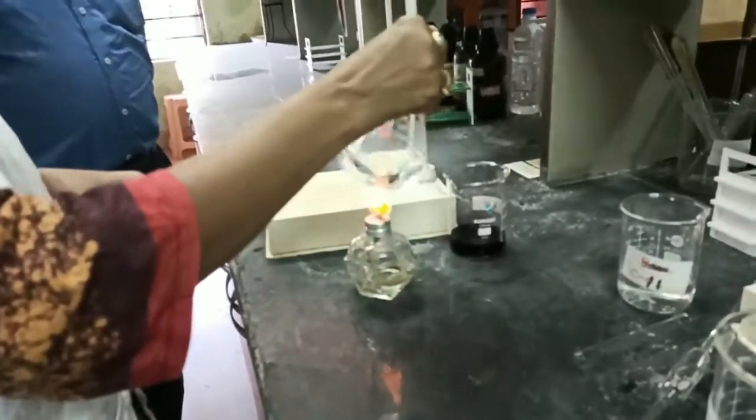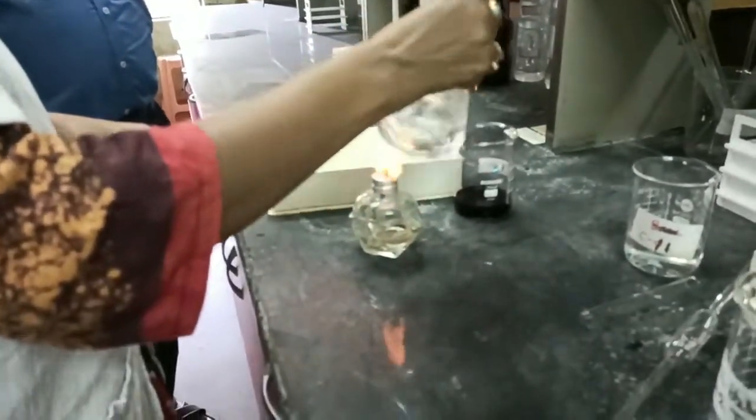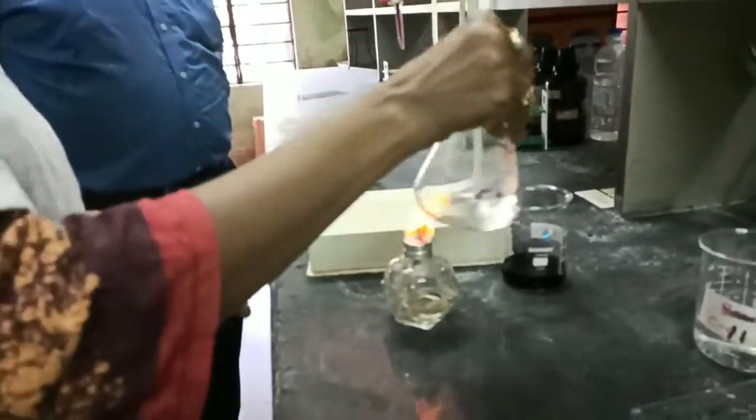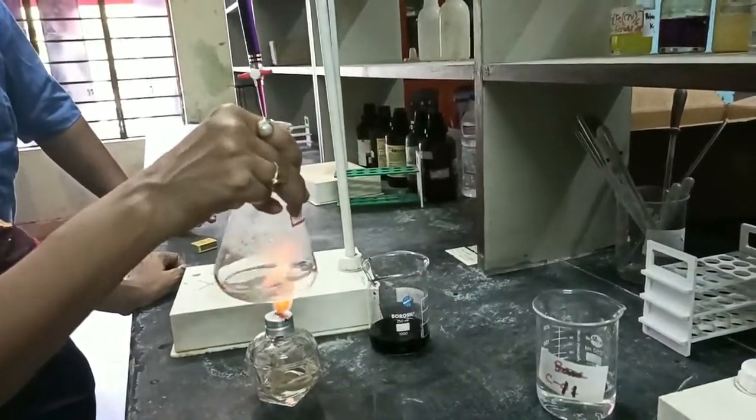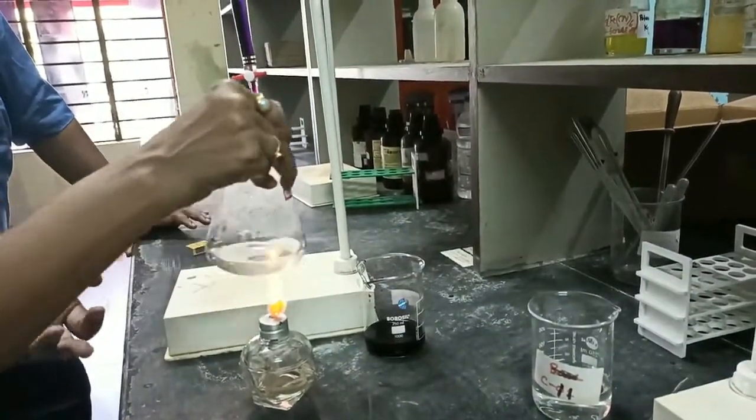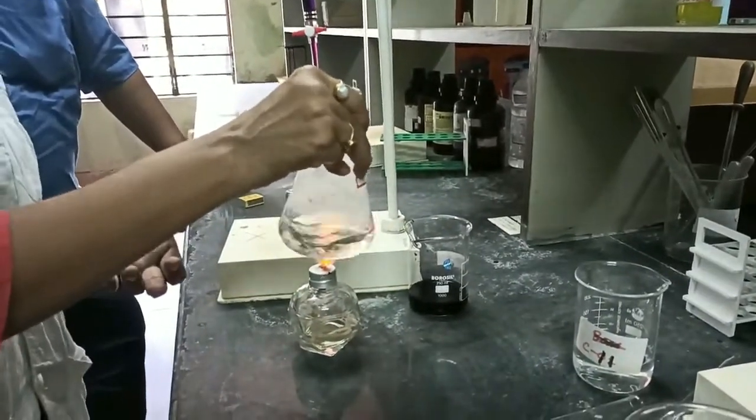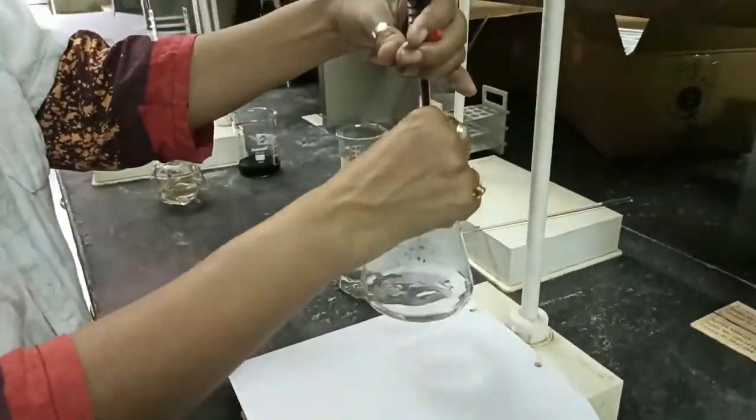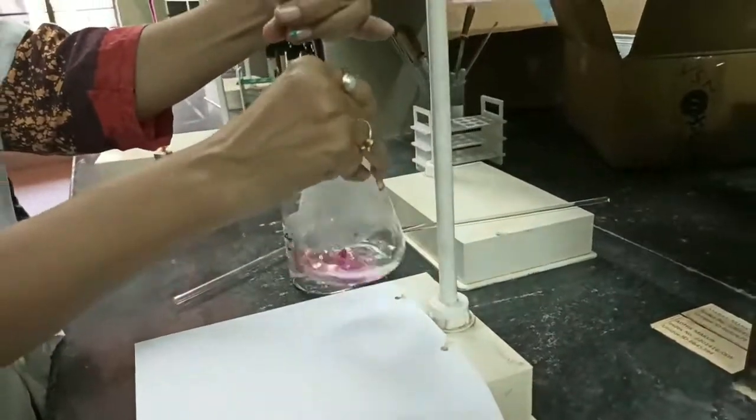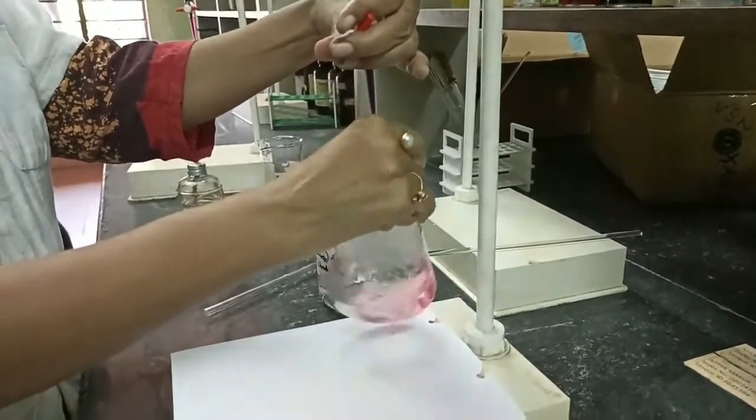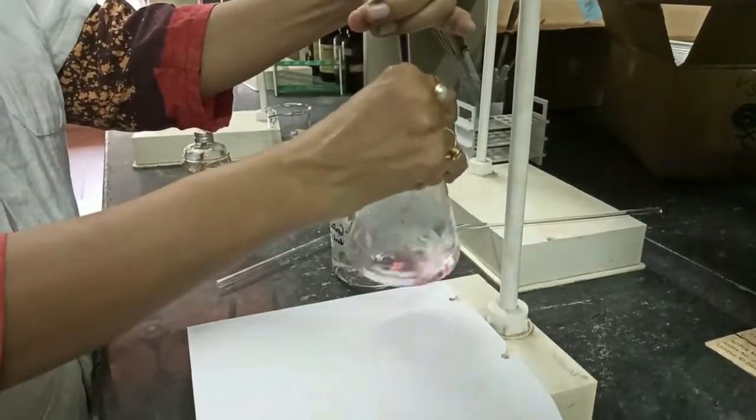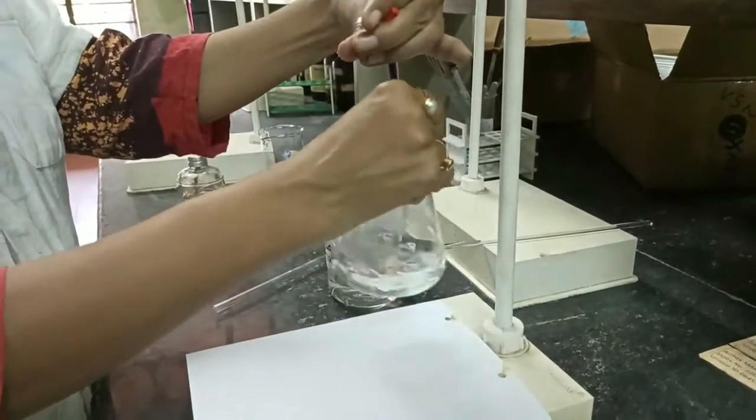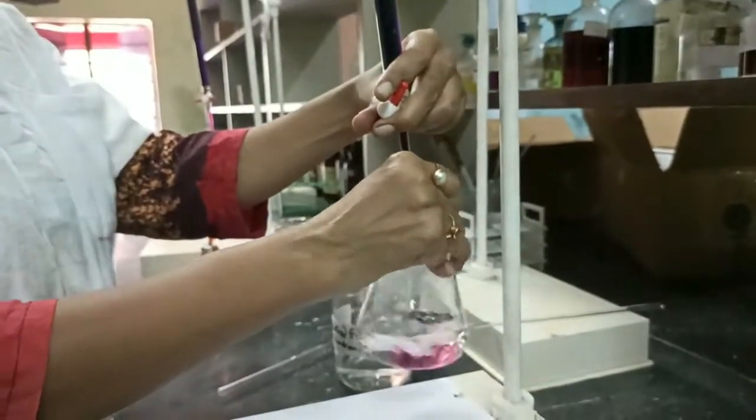Make sure the solution should not boil. When it is almost unbearable to touch, at that point of time we should start the titration rapidly with the solution. We need to do the titration process very rapidly so that the temperature remains in the range of 60 to 70 degree centigrade. If the temperature falls during the titration then there may be a possibility to have a wrong reading.